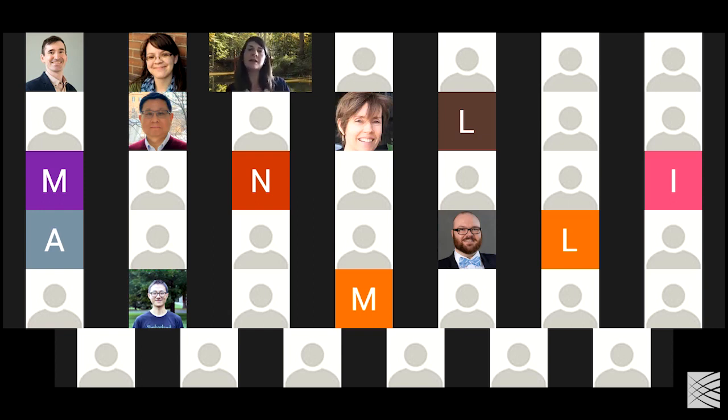So the first thing when you're troubleshooting data tables is, one, make sure your entity table is actually uploaded to Terra. You can't make a set table unless you have an entity table. So if I didn't have a sample table in Terra, I wouldn't be able to make this set table. The second thing you want to make sure is that this syntax is correct, that you have membership : sample set, or whatever your entity name is, set ID. And then the third thing is to make sure that your second column in your set table has the same name as the entity name. So if you're, again, making a sample set table, this needs to be sample.